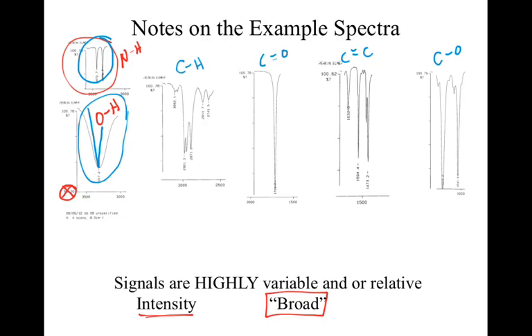Ultimately, you're going to need to look at more and more spectra. So you've got the 10 examples that I gave you in the IR assignment, and then you have probably another 5 or 6 spectra in the Sapling. Your textbook's going to have a ton more. Use your textbook. The answer's at the back of the book, I think. Use that to kind of compare and match through.